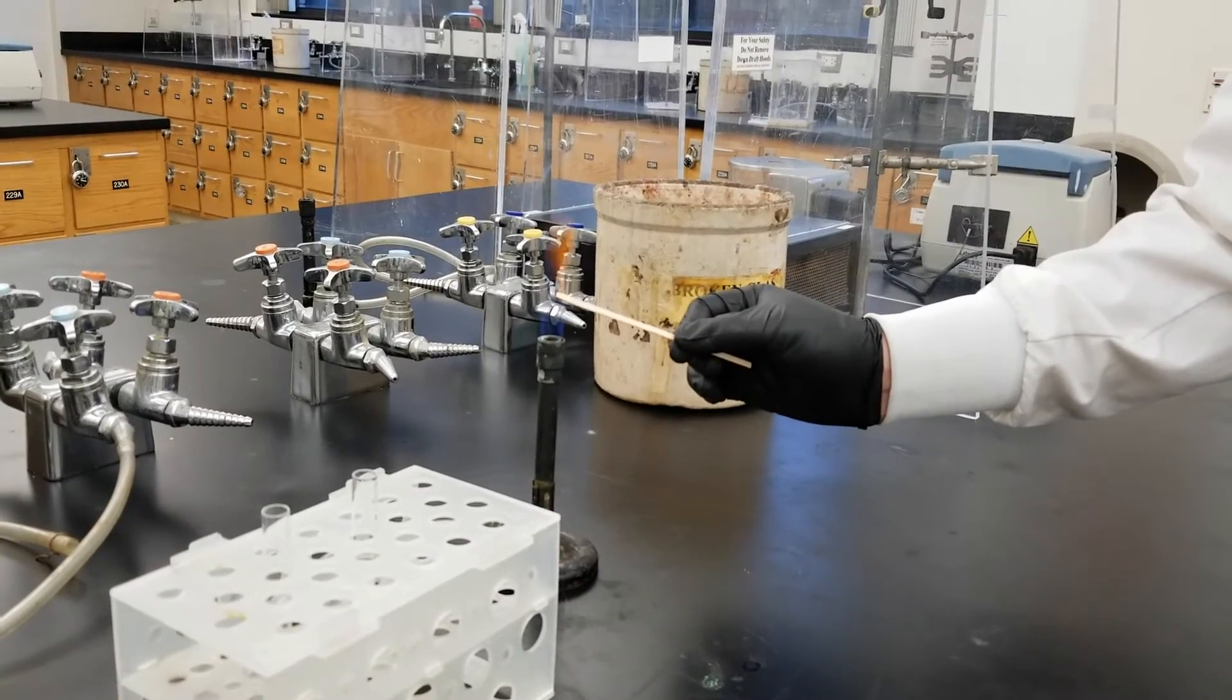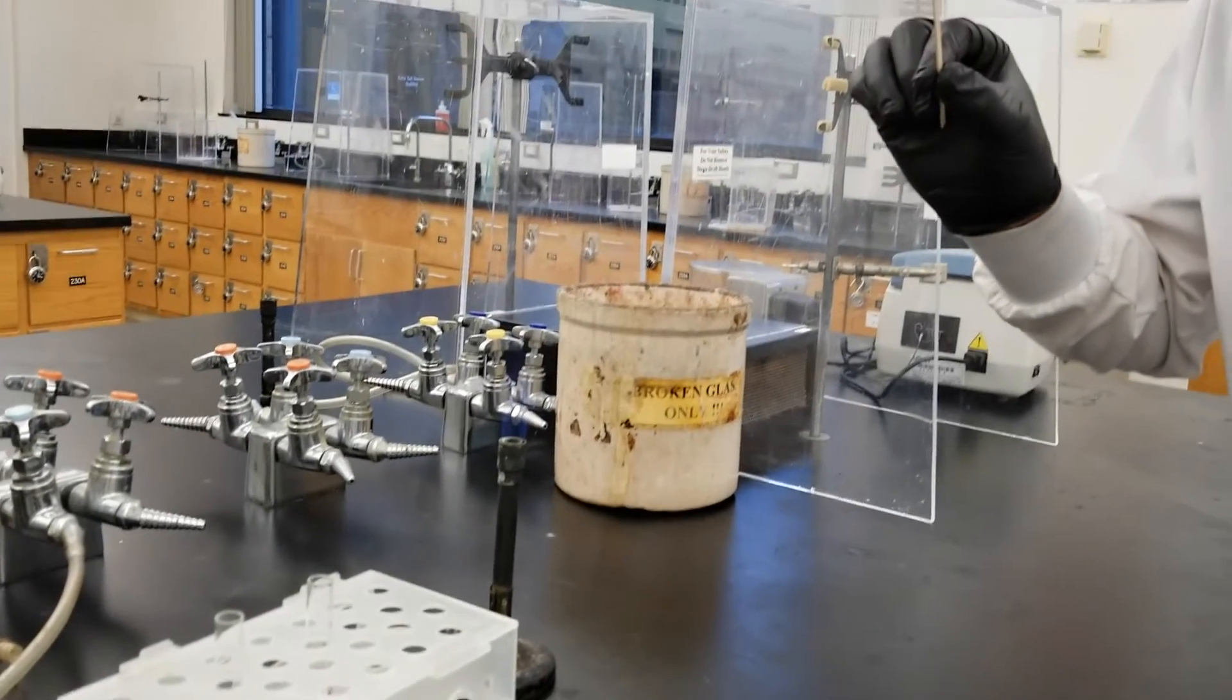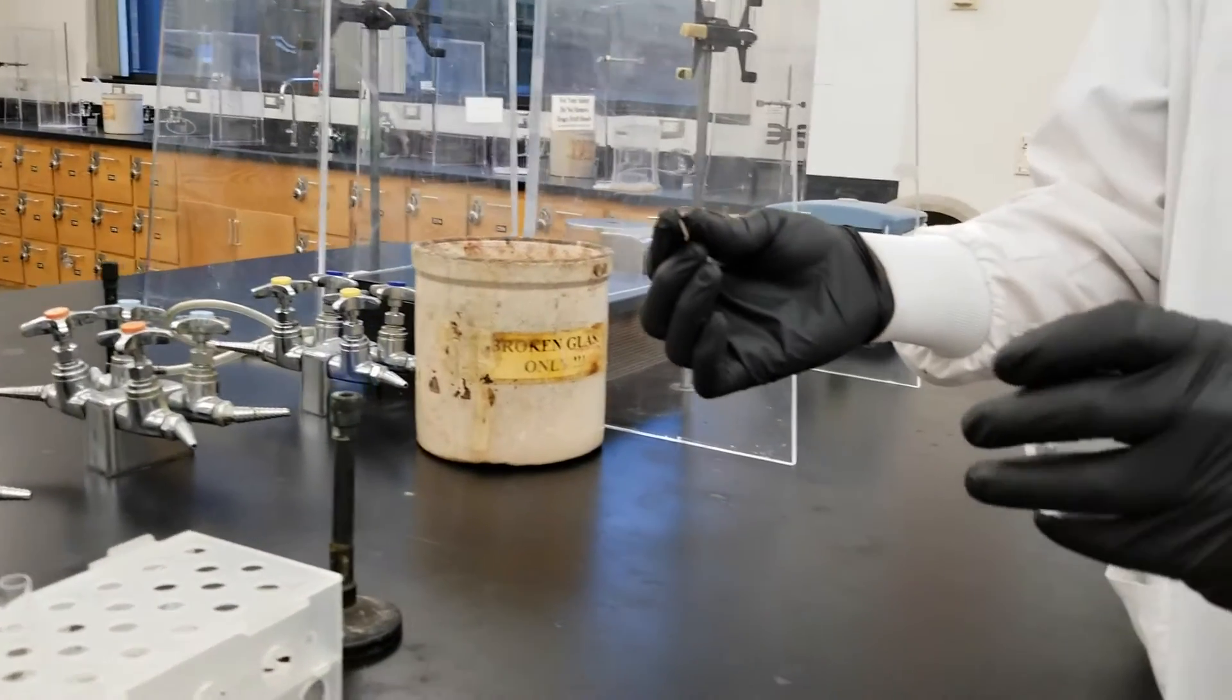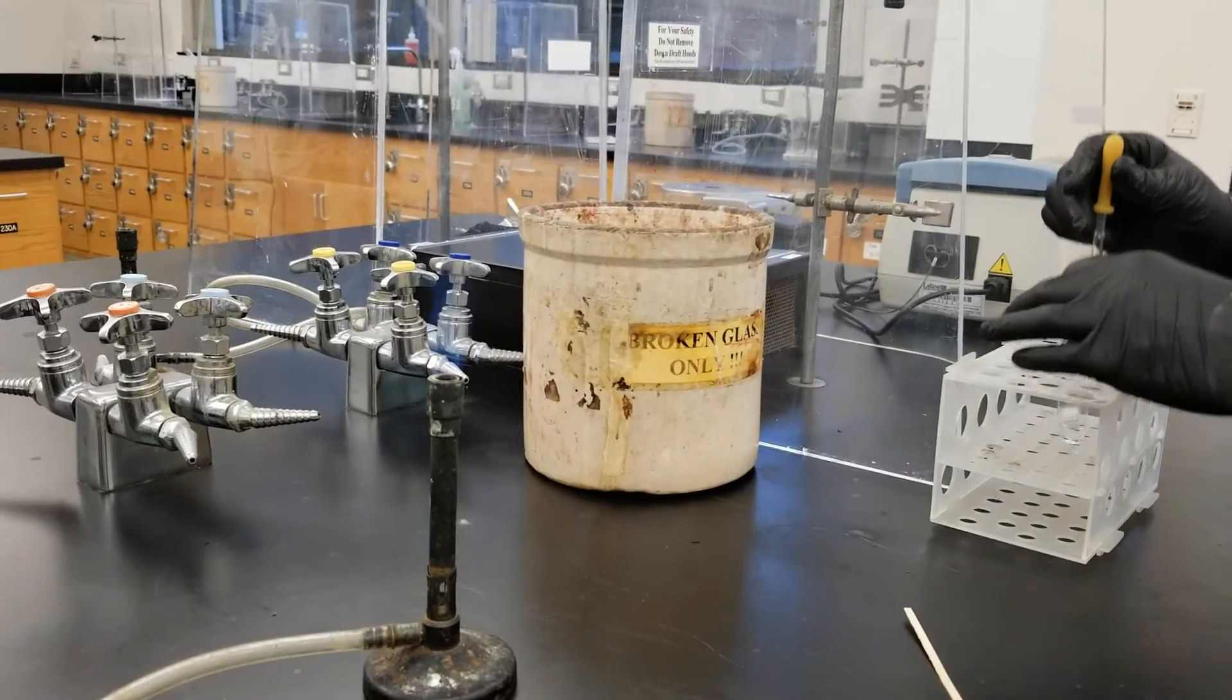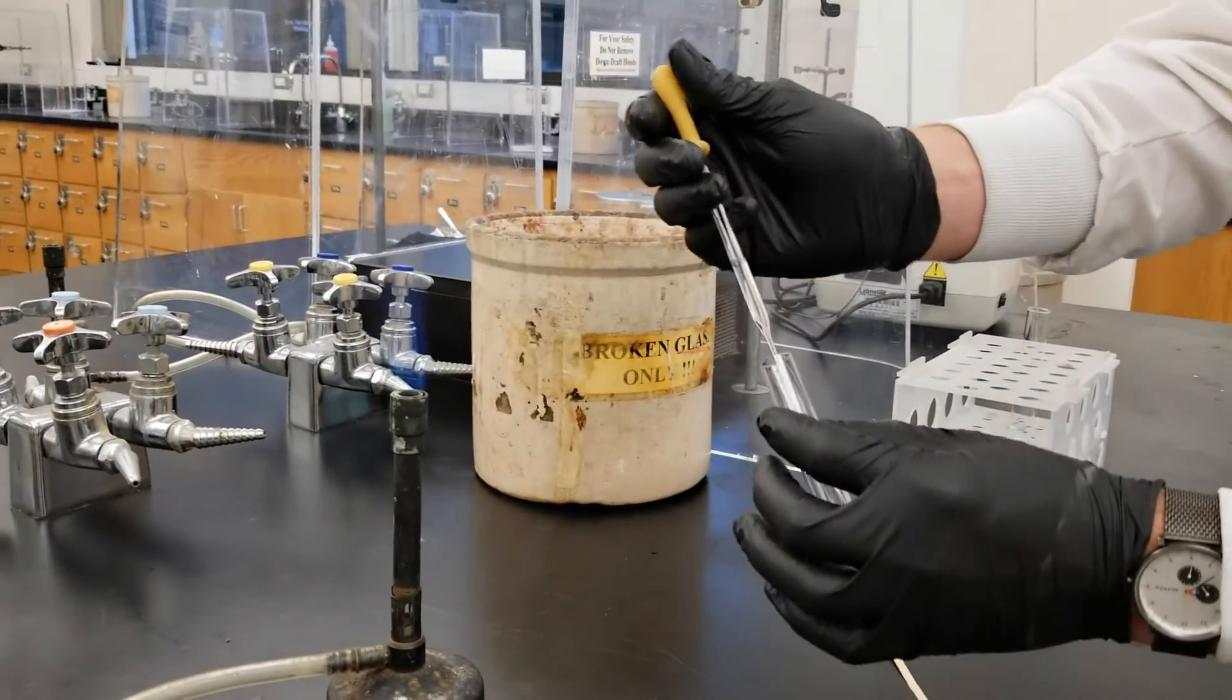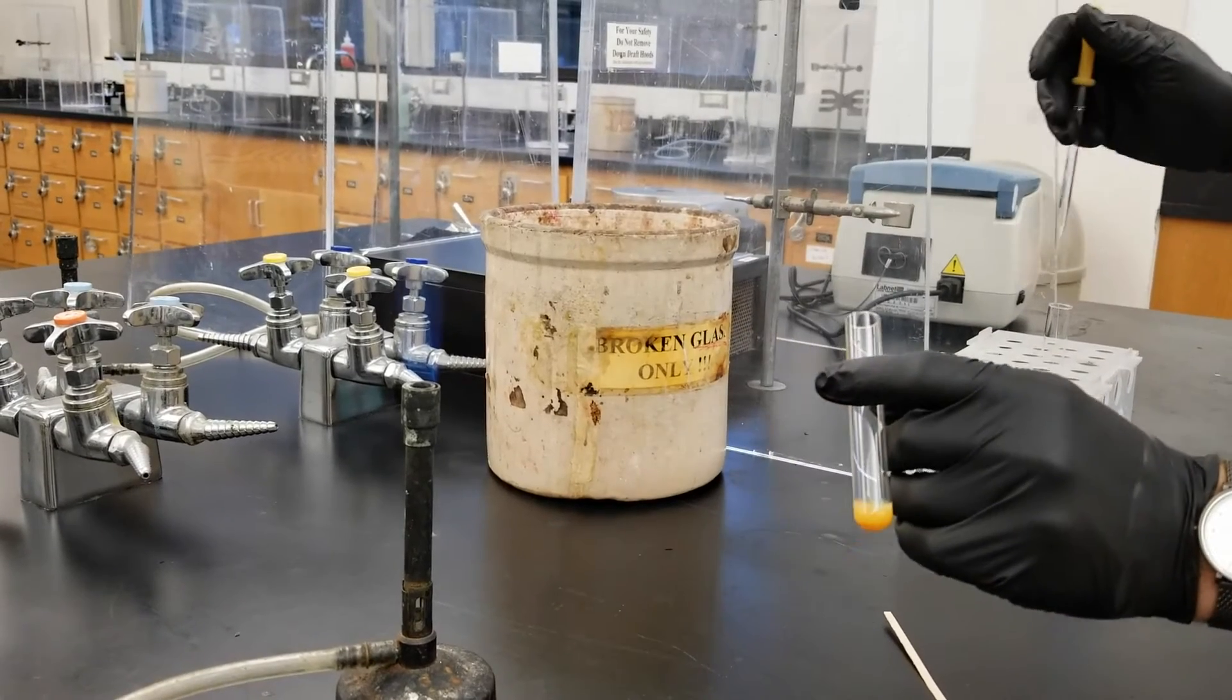In the third test for this experiment again you'll have a glowing and burning splint test and again make sure that you do the reaction twice, once before the glowing splint and once before the burning splint. In this case where you're decomposing hydrogen peroxide it can bubble and overflow so make sure that you add it slowly when you're adding it to the KI.